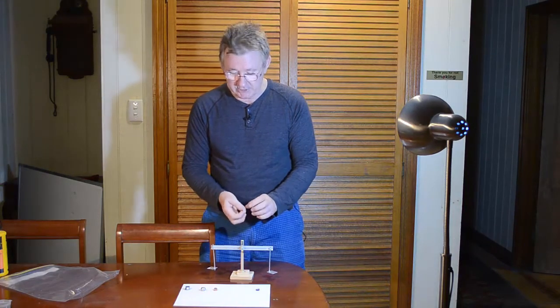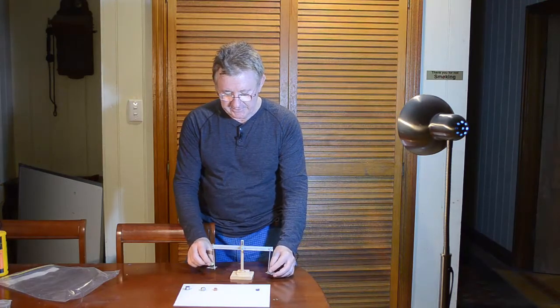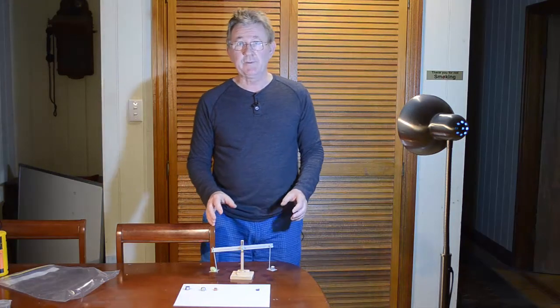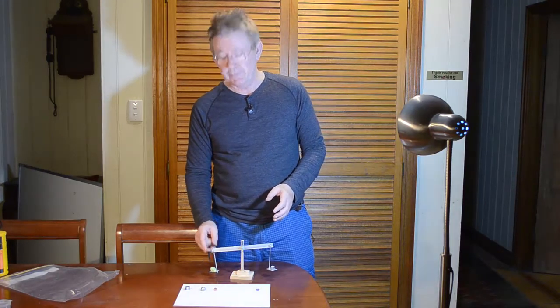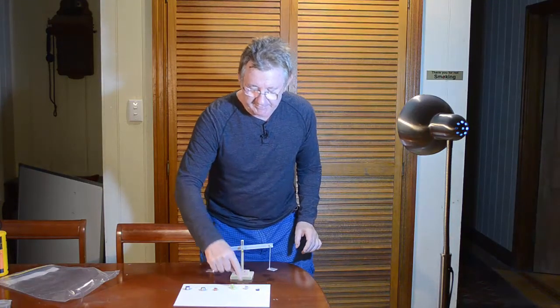Sometimes if they're real unsure, they can switch these over to the other side, because these mass balances are not always perfect. I may not have balanced them exactly right, but you can see that here it's also going down on the right hand side, so that sulphur is heavier. We've changed this around now. Now we've got carbon, aluminium, sulphur.